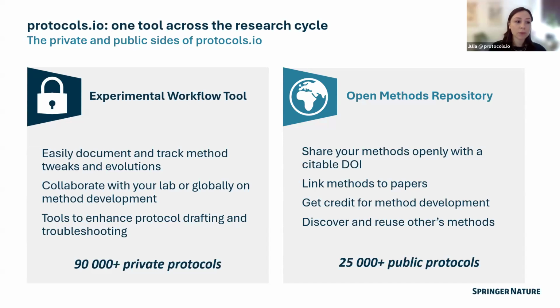There's lots of functionality on the private side of the platform that allows you to track that method as it evolves, and to do that in a collaborative way with others in your lab, or if you are working in a more global consortium, collaborating across multiple countries.